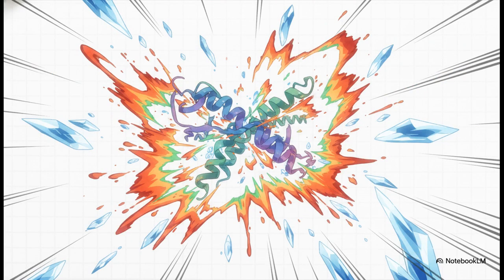The real game changer here was the invention of discontinuous or freeze-frame chemistry. Researchers figured out that if you hit the reaction with a highly acidic reagent, like sulfuric acid mixed with titanium tetrachloride or ammonium metavanadate, it instantly denatures the catalase enzyme. Boom. It effectively stops the reaction at an exact, measurable millisecond, halting the enzyme right in its tracks.